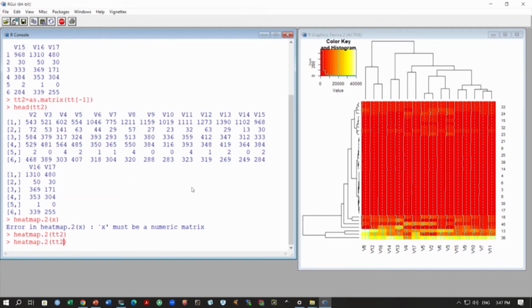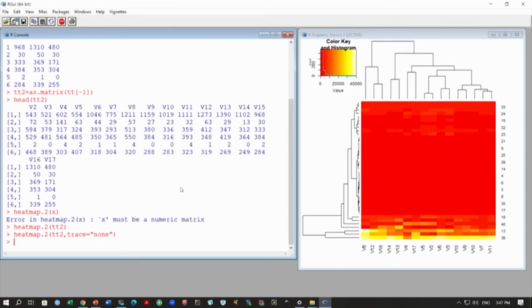So, what I will do, I will make it a bit nicer. One of the things you will probably see is some lines that are going through this heat map. So, first let us remove those, and you can see the scale here on top. Red means negative or close to 0, yellow means positive numbers, like large positive numbers. Now, when you are generating a heat map, one thing you have to be very careful about is that you are working with genes that show a very high degree of difference in their expression pattern, and if you are using those genes for clustering, the ones with very high expression will dominate the clustering process.